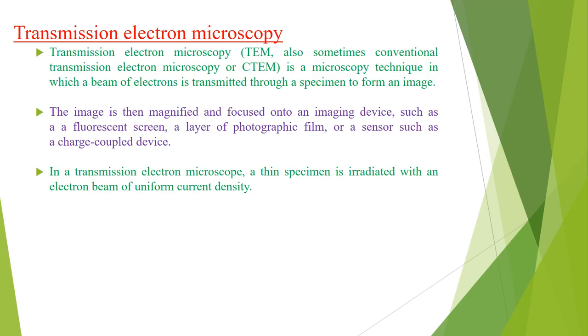The specimen is most often an ultra-thin section less than 100 nanometers thick or a suspension on a grid.